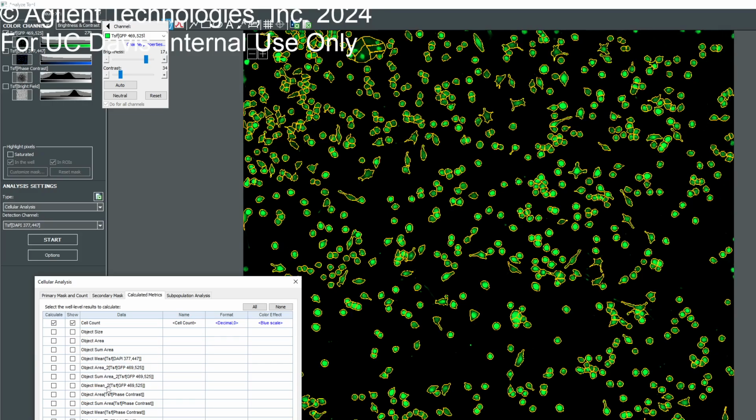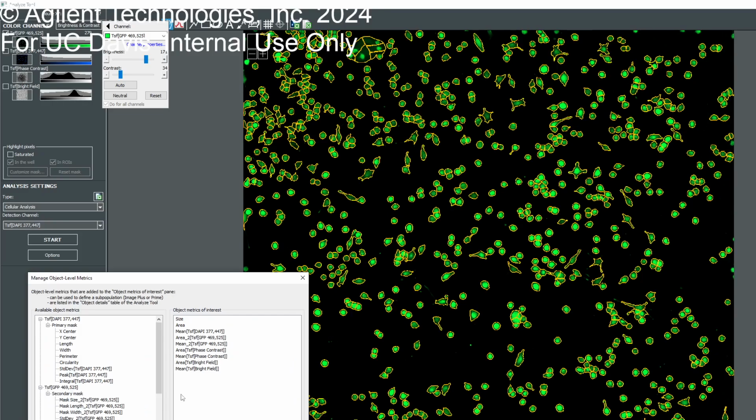For the secondary mask, you can get some parameters here. But if you go to the select or create, we can have some more, like length and width. And then also there is a size. I don't know if the size is going to help you or not. I can't remember what the calculation is for size. There is some mathematical equation that uses the length and the width and determines the size based off that. I can find it out before I leave and show it to you.